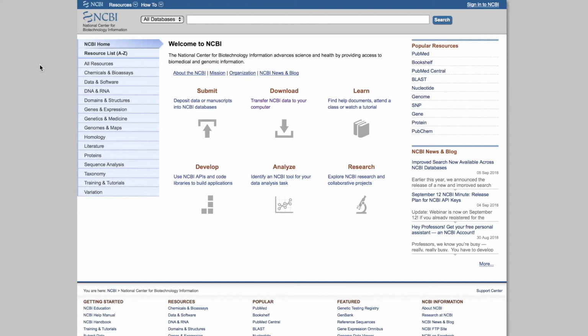In this short tutorial, I want to show you how to identify the dataset and then find the data that you can download and prepare the sample metadata for the analysis. Okay, so what I'm going to do is type in here the name of the publication, the date, and the author.